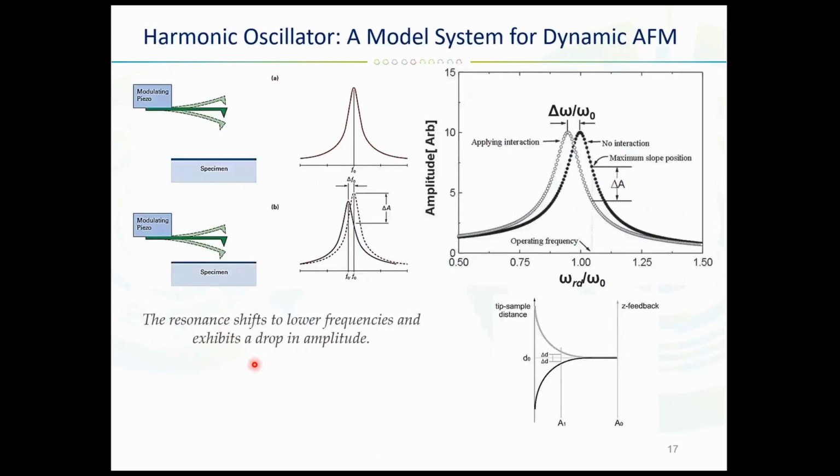First of all, we can optimize the cantilever spring constant. The stiffness of the lever must suit the material that you want to image. If the cantilever is too stiff, the result may be destruction of a sample and wearing out of the tip. If the cantilever is too soft, it may not be able to interact with the sample and generate any contrast.